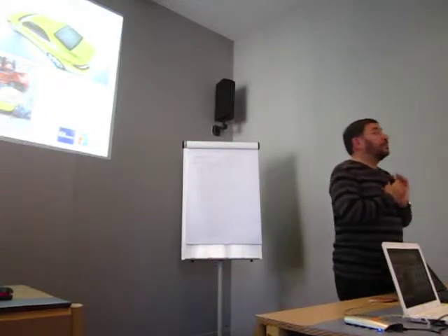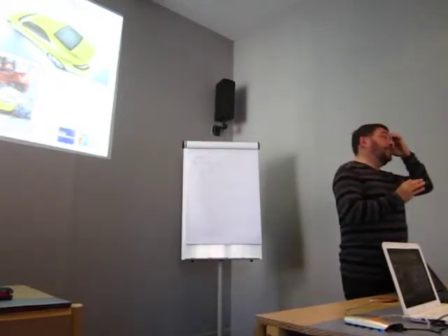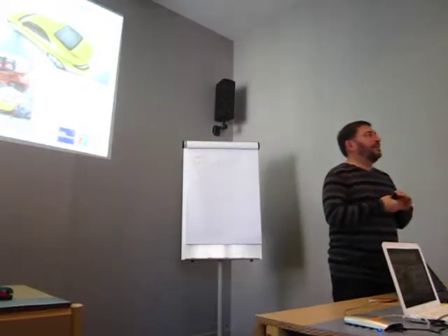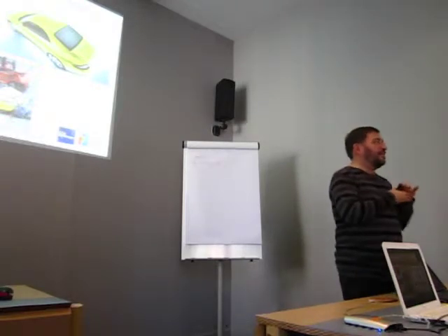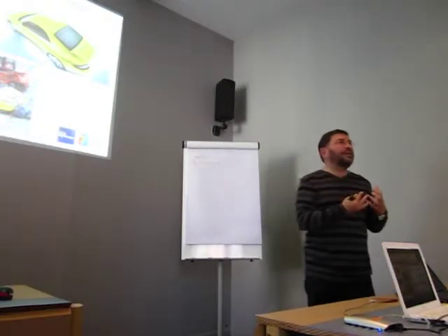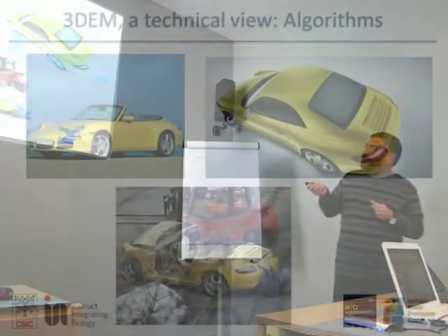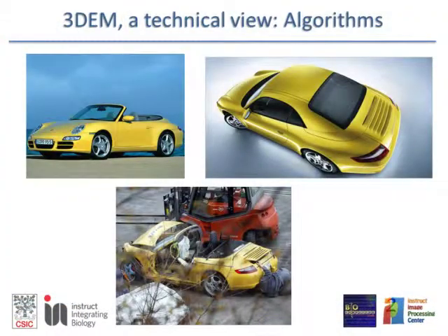Another challenge that we have is that cell biology is doing fantastically. It's a growing field, but I don't know how many of you have tried to work with cell biology at the structural level. Really, it's very complicated. It's very complicated because you can have a fantastic sample that is absolutely functional, because 10% of your specimens are like that and 90% are like that. And actually, it's very difficult to sort all these different conformations. How are we going to sort them? Well, finally, we have been able to.